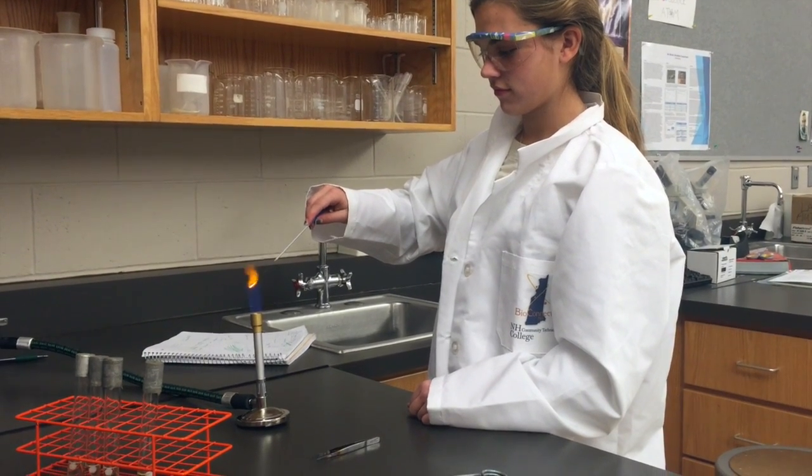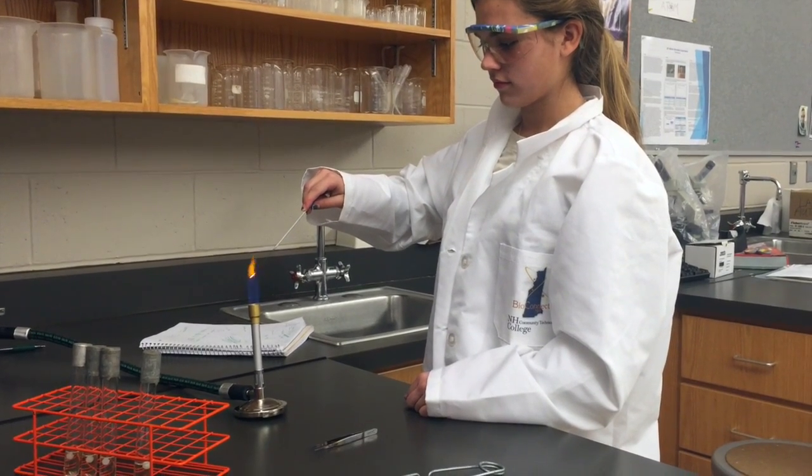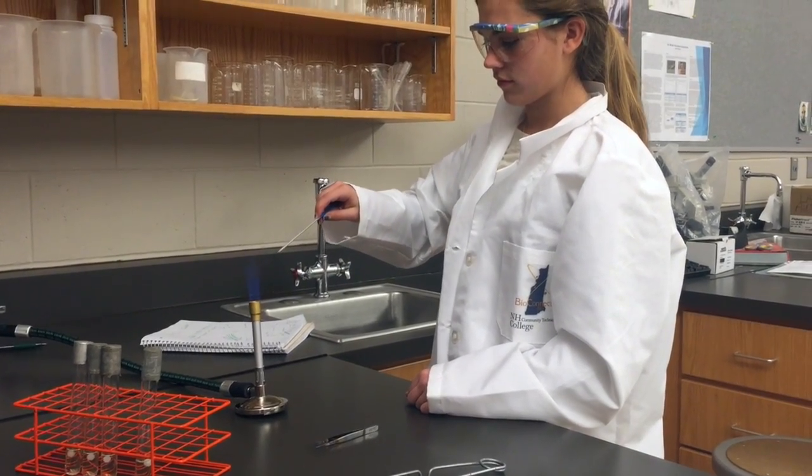When placing a bacterial colony into a sterile evolution tube, more than just the loop is going to go inside of the tube. So ensure to run the flame up and down the thicker, metal portion of the loop. It is not necessary that this area become red hot.